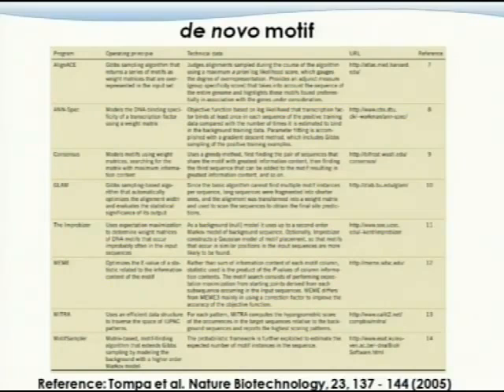It's not that their math doesn't work when you go to 10,000 regions, it will just take much longer, and you have to take precaution on that. I heard there's some effort to work on de novo algorithms based on ChIP-seq level data. I haven't seen too many publications, but if you find some, do let me know, and I'm happy to read those.